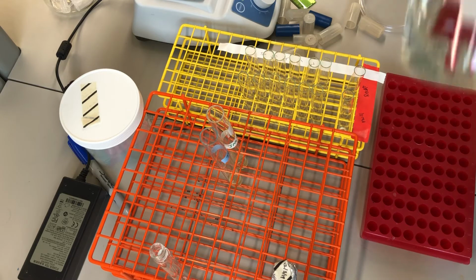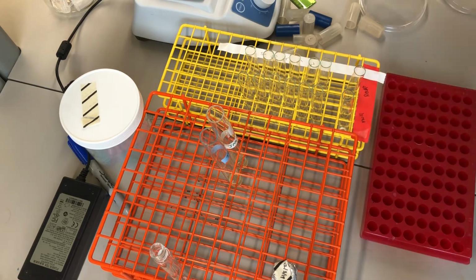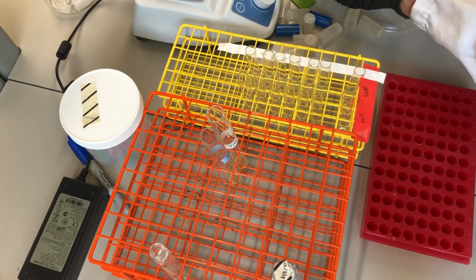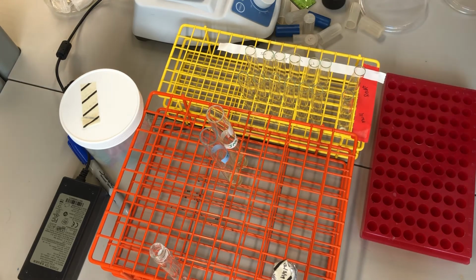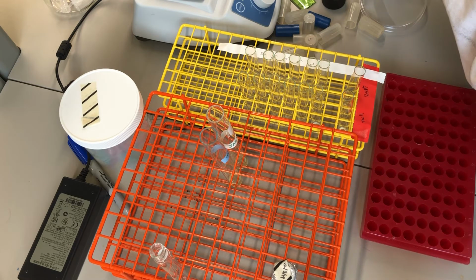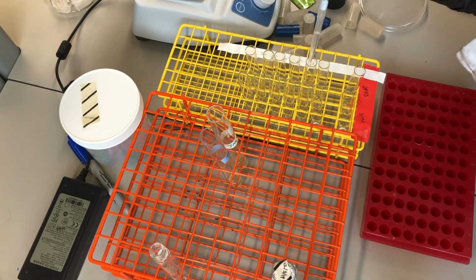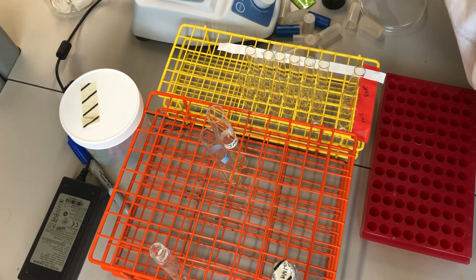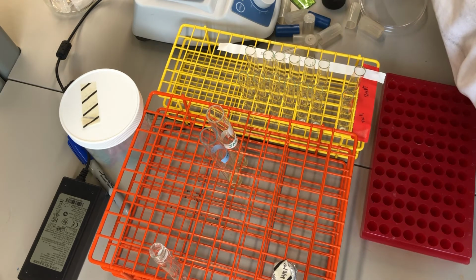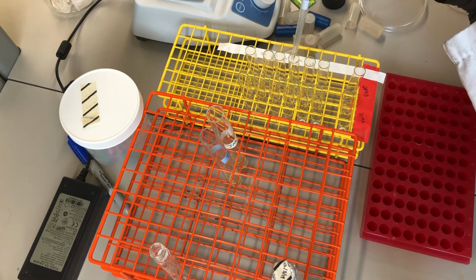I'm using the 0.85% sodium chloride solution, and I'm pipetting 900 microliters to each of these tubes. Just like you did with the mutate DNA experiment. It's very important to get 900 microliters to each tube and not double fill any one tube, because that would throw off the dilution schedule.